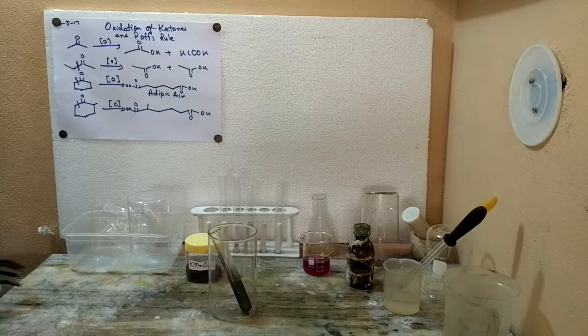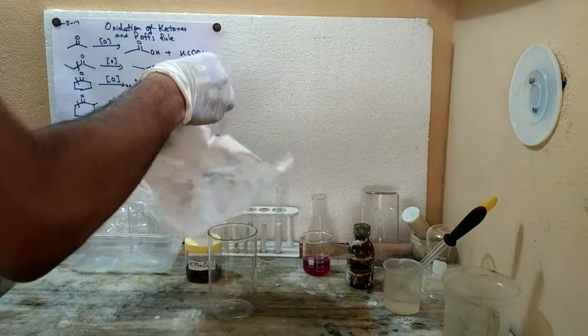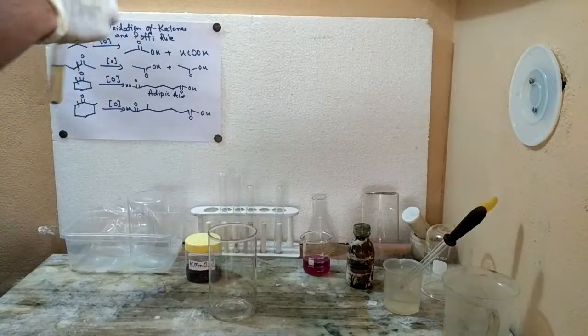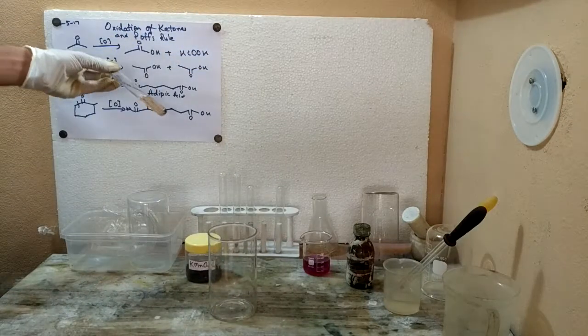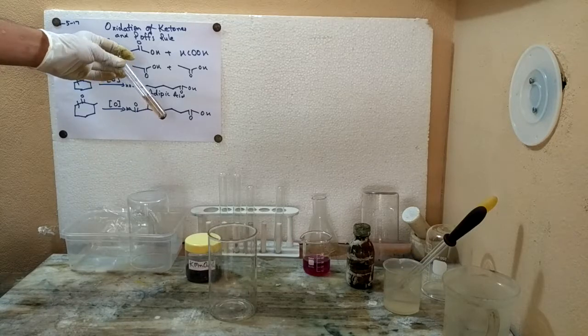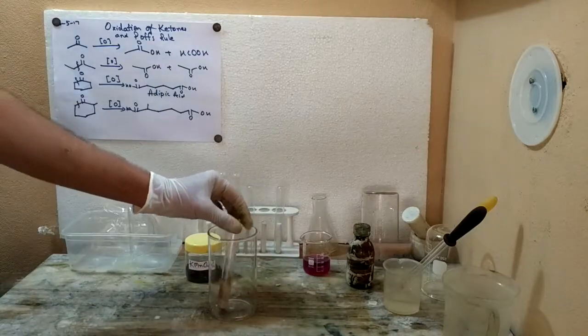The test tube has charred, so I just need to wipe the carbon from the outer walls of the test tube. You can see that the potassium permanganate has completely decolorized, which indicates the end point of the reaction. So this was the oxidation of acetone.